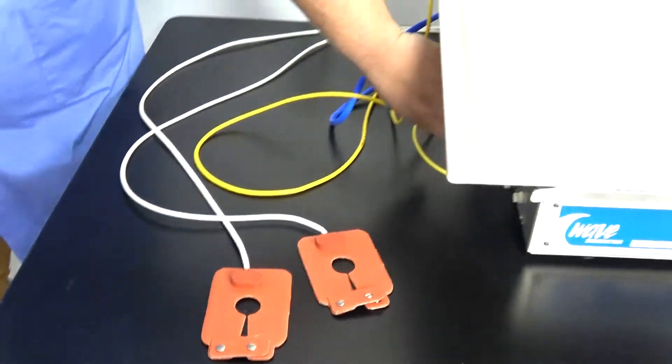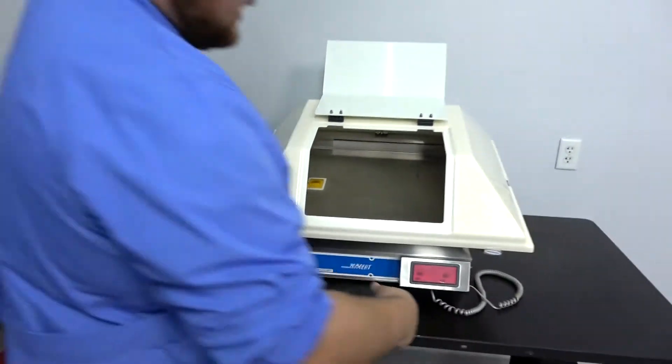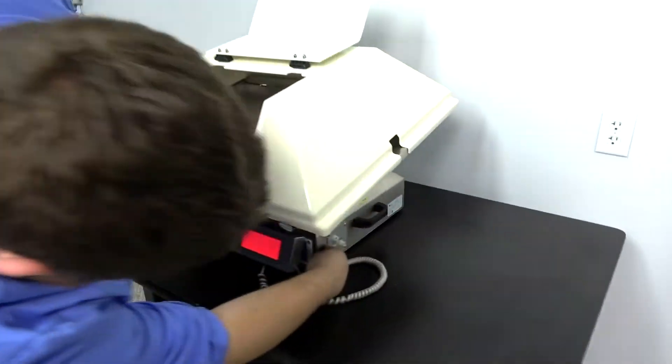Right down here, you can see you have your air inlet and outlet, and on the other side, we have the CO2 inlet and outlet, right here.